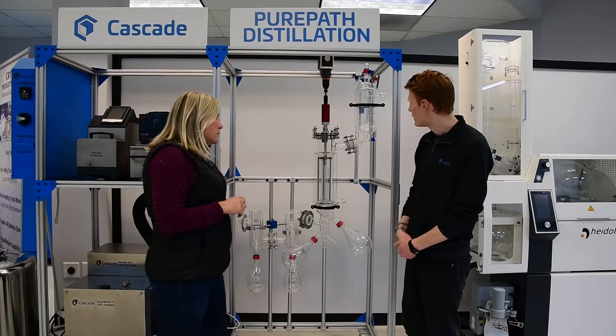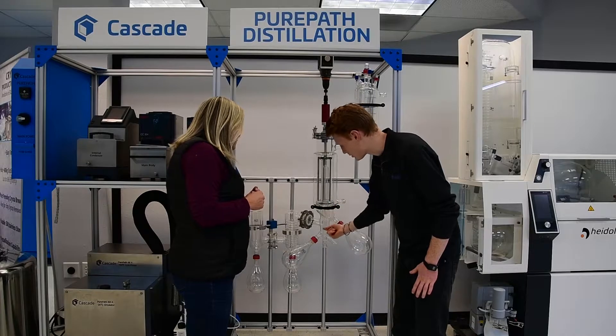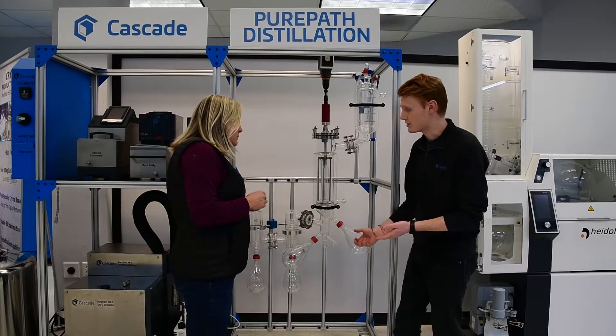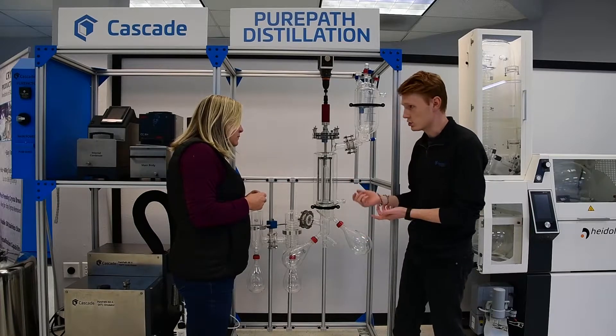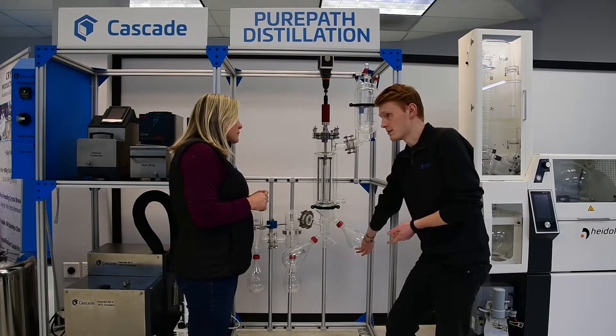So the first thing you're going to do is you start with your crude in here and it's going to drip down. Your light fraction is always going to end up in this flask. And depending on your temperature parameters, that light fraction — the first runner — should be terpenes. You're going to end up with terpenes down here, and everything else is going to end up in this heavy fraction.